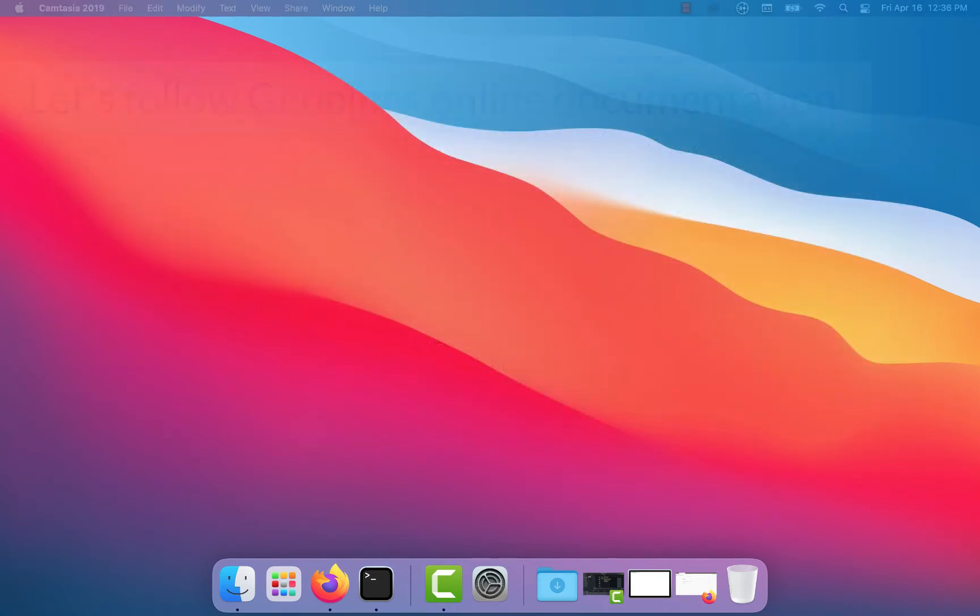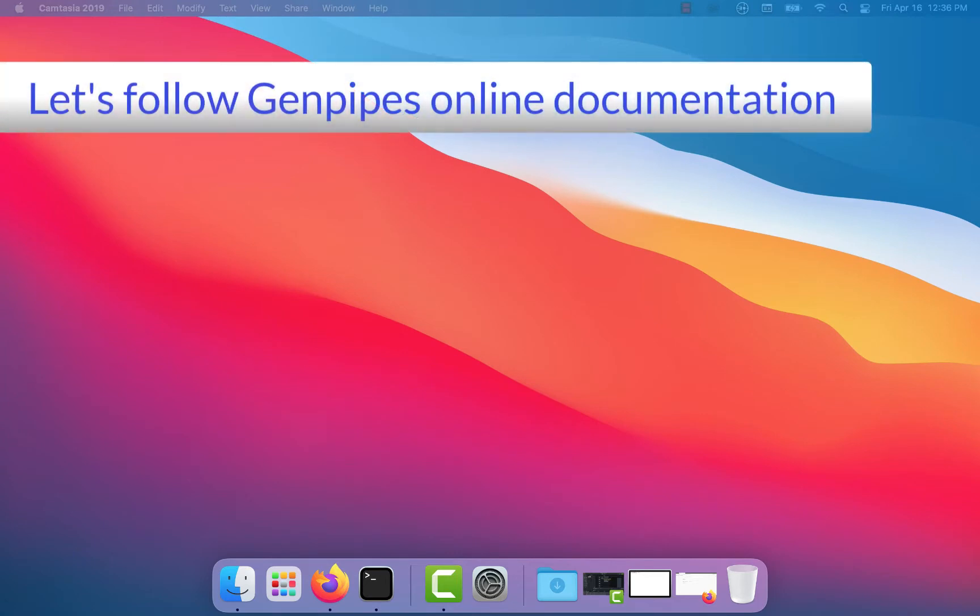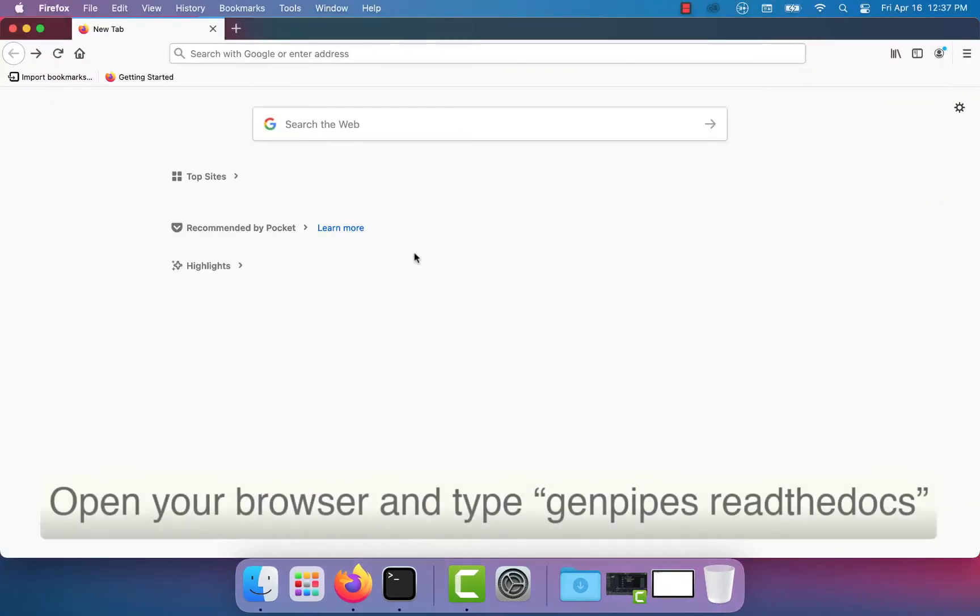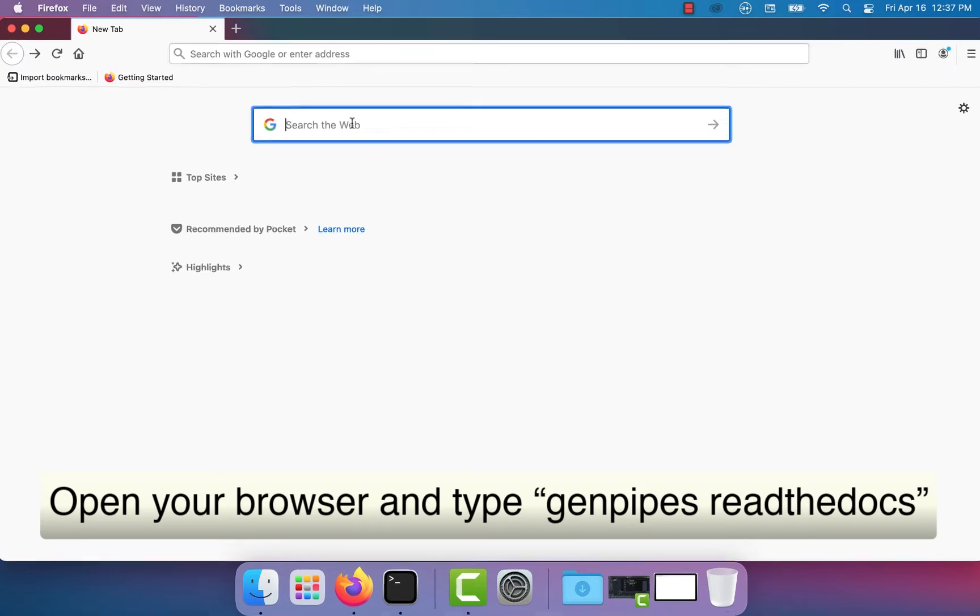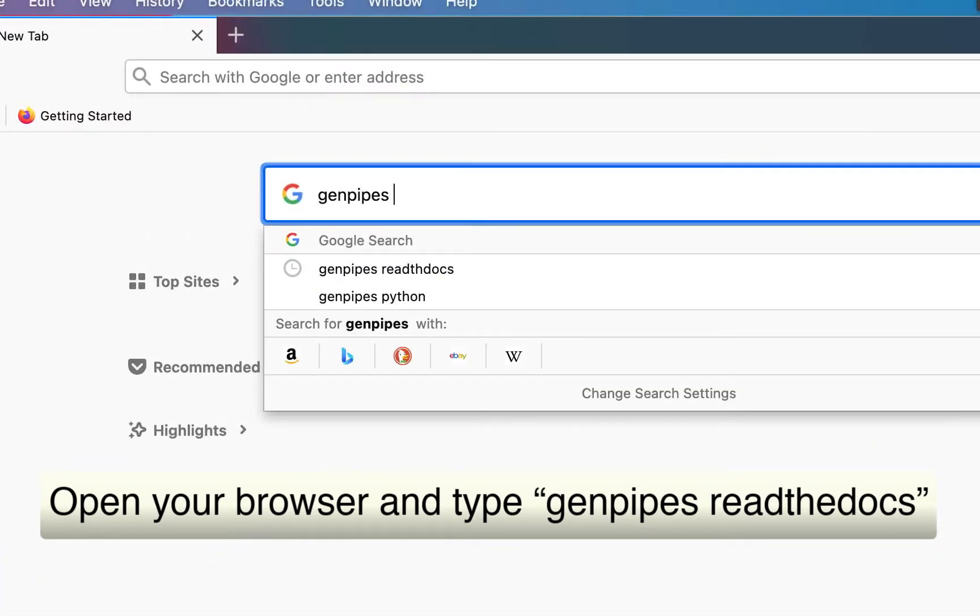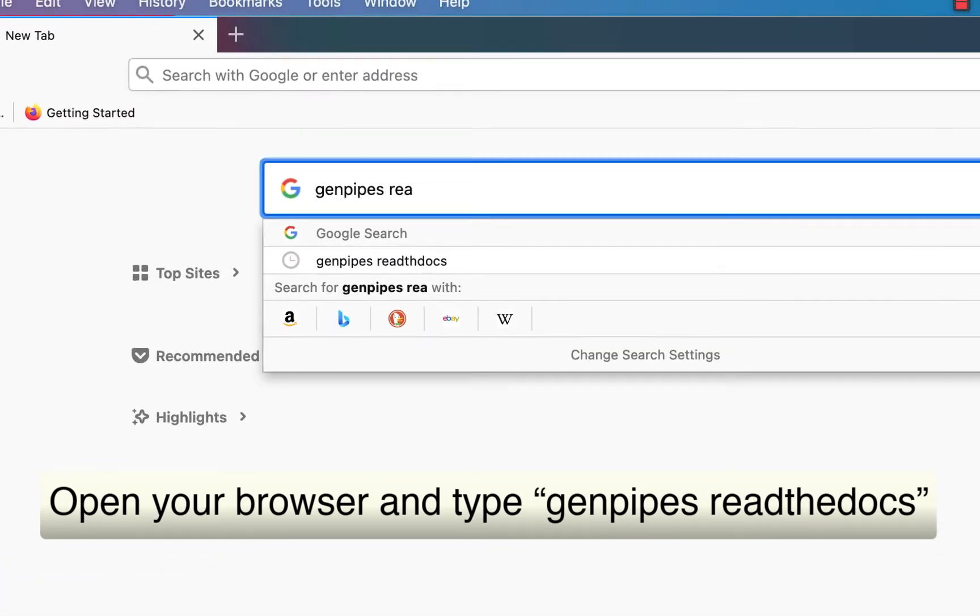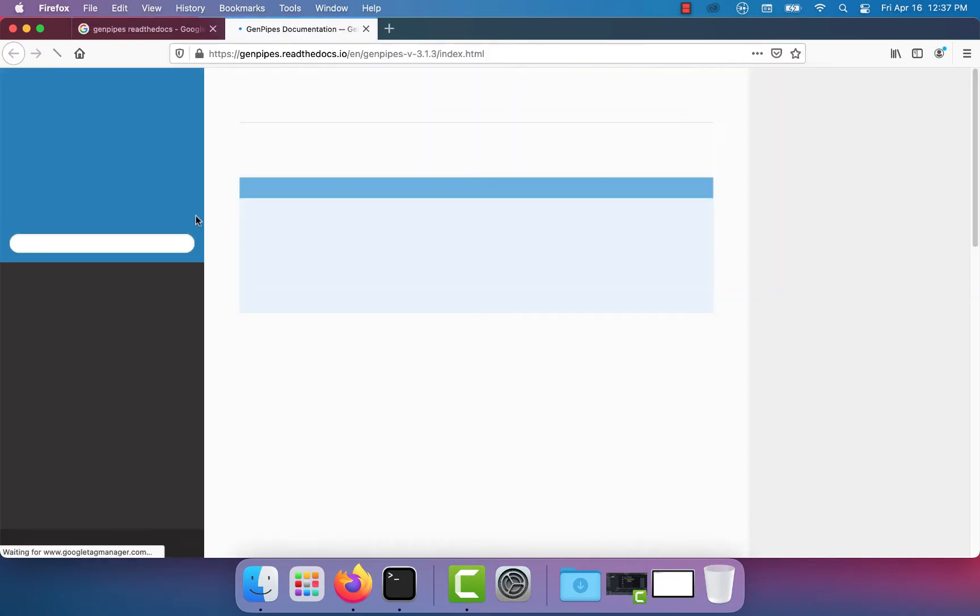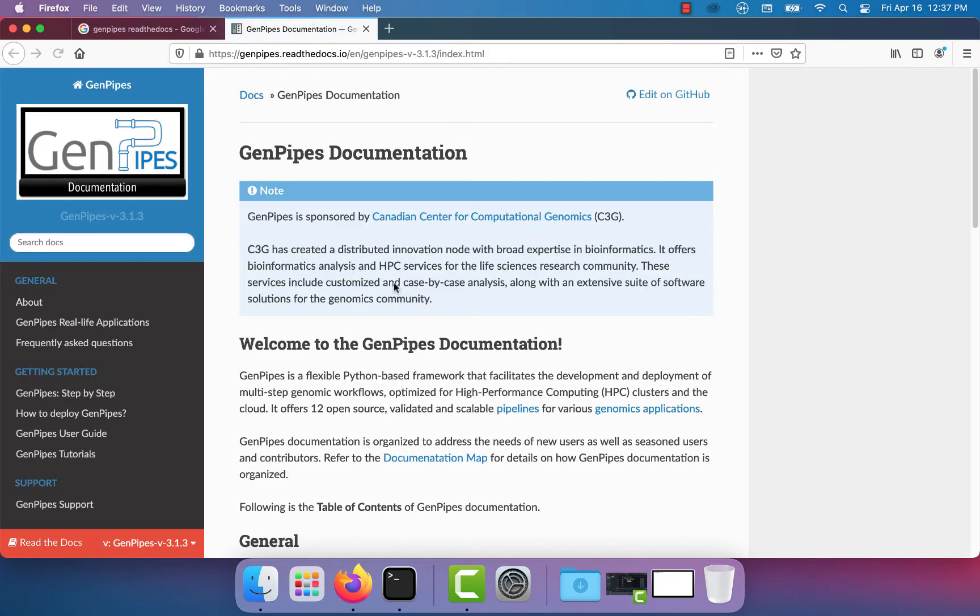For this video I will follow the GenPipes online documentation. First open your browser, type GenPipes read the docs in the search bar and press enter. Click on the first link and go to the online GenPipes documentation.